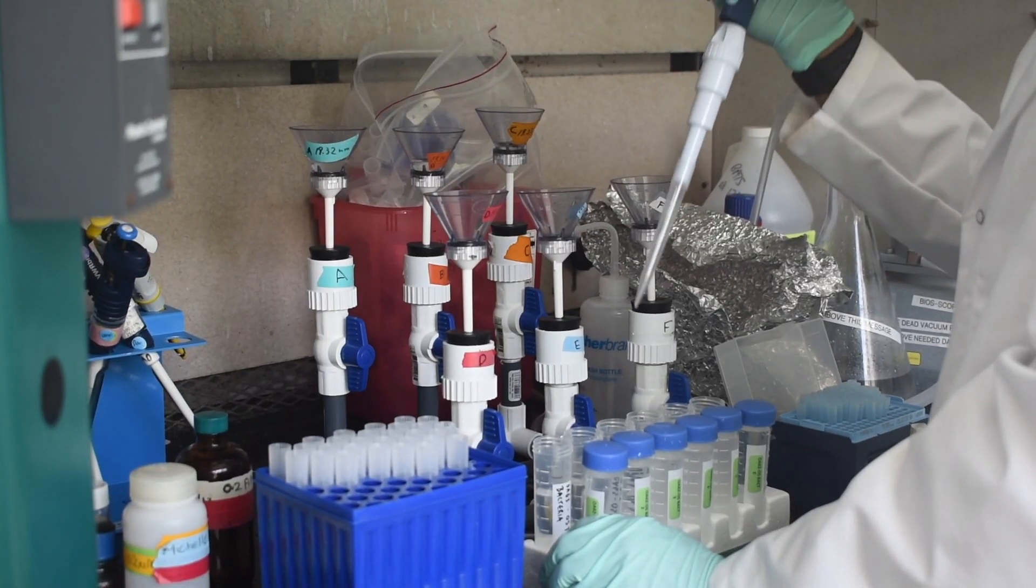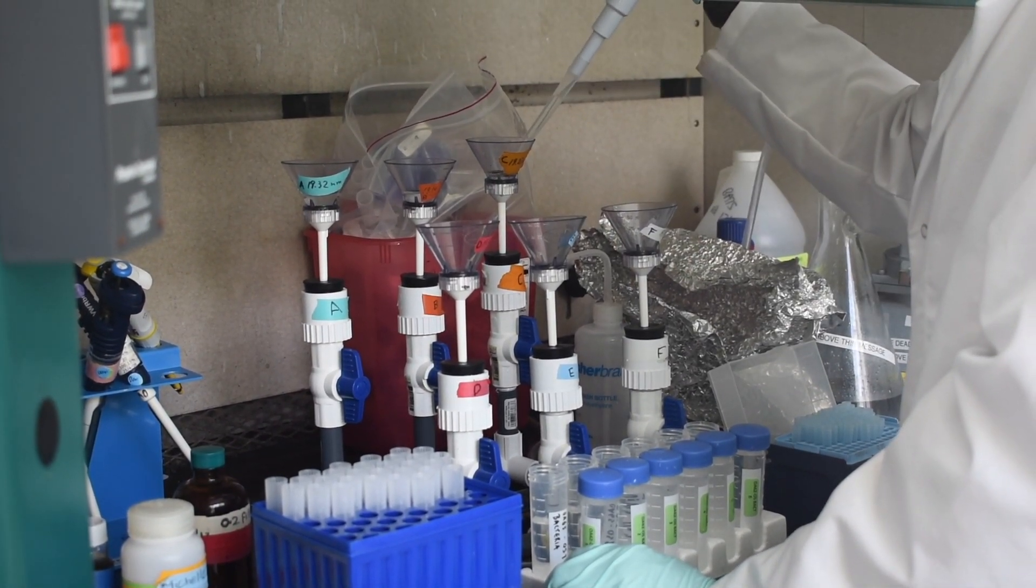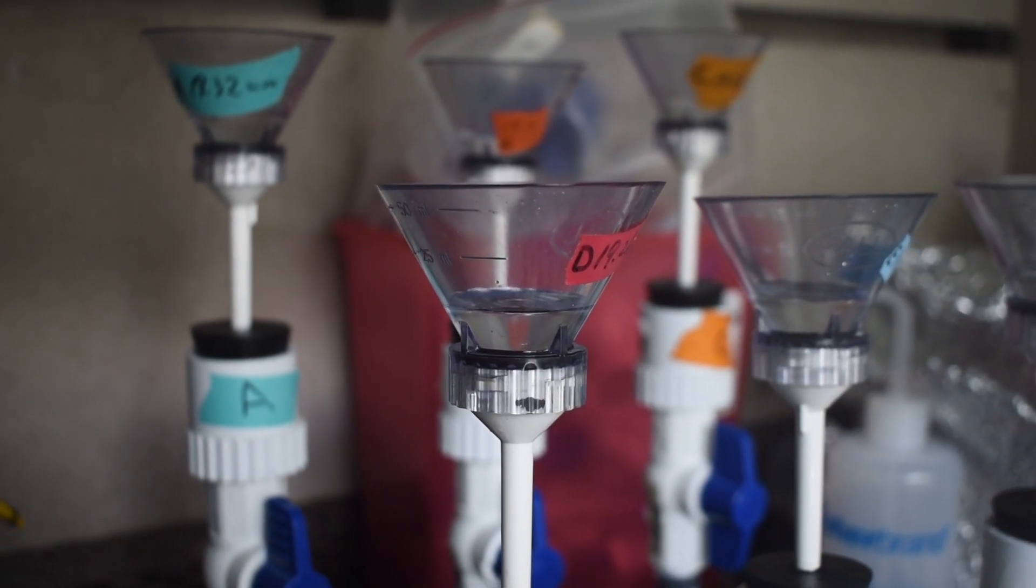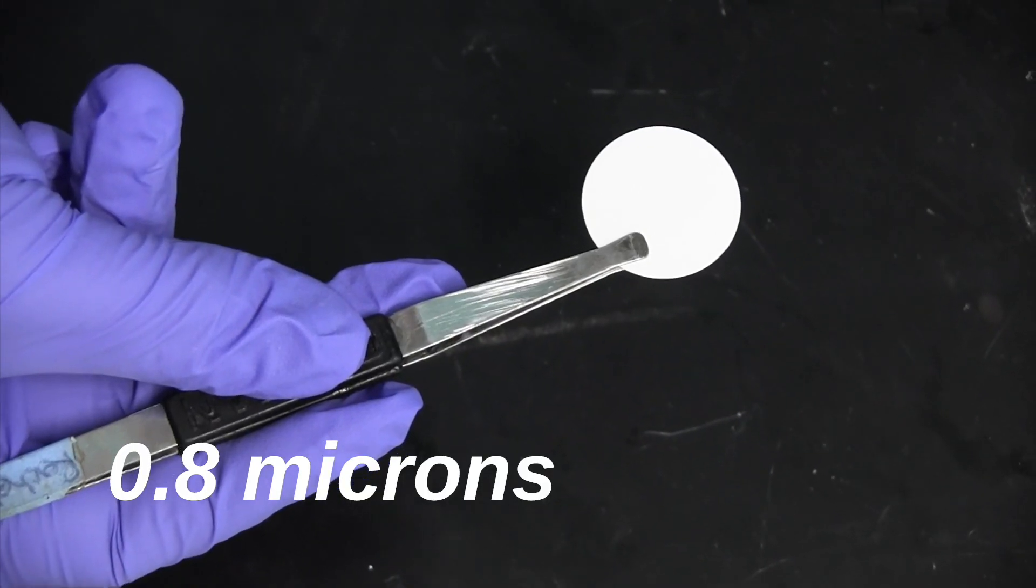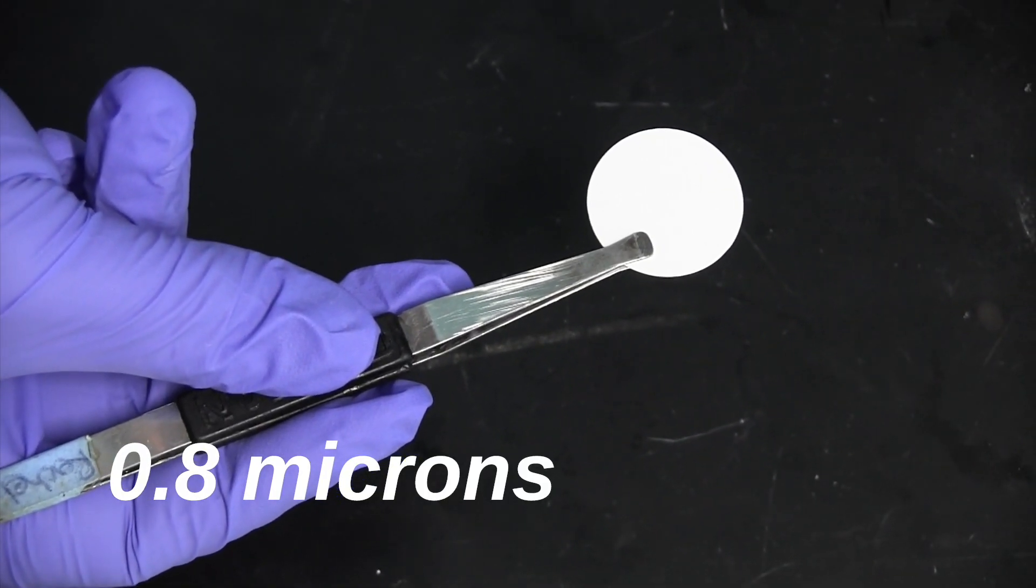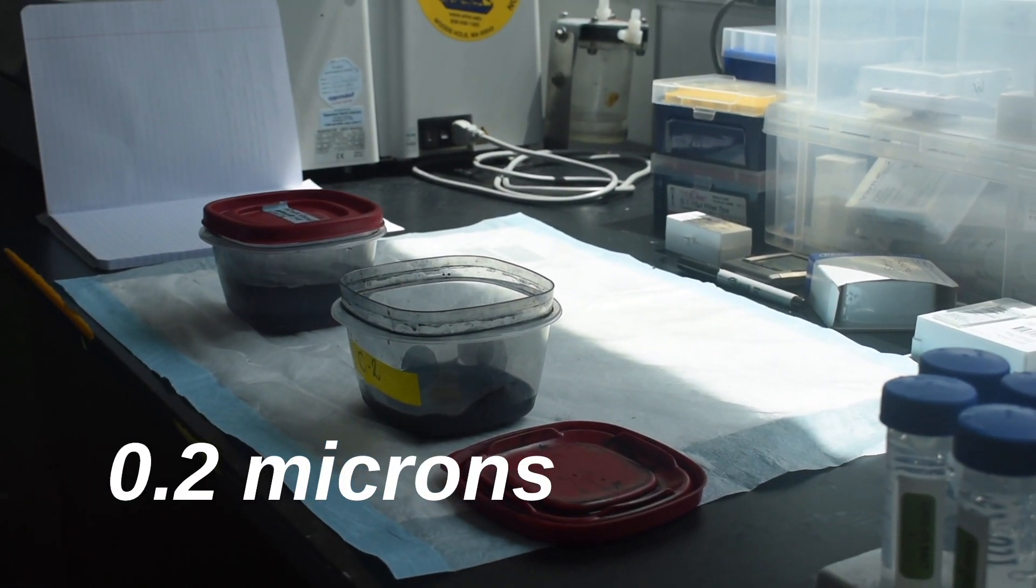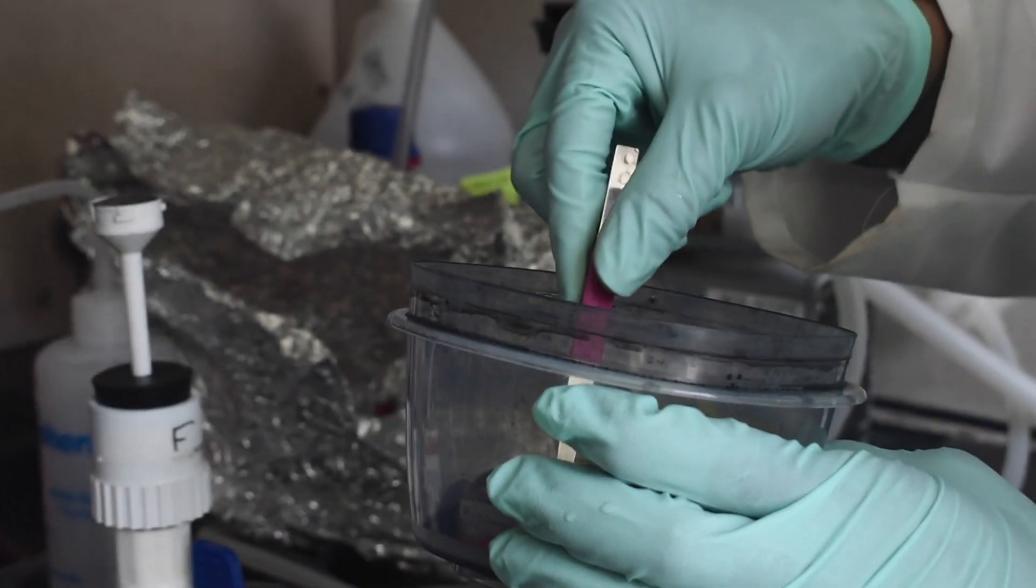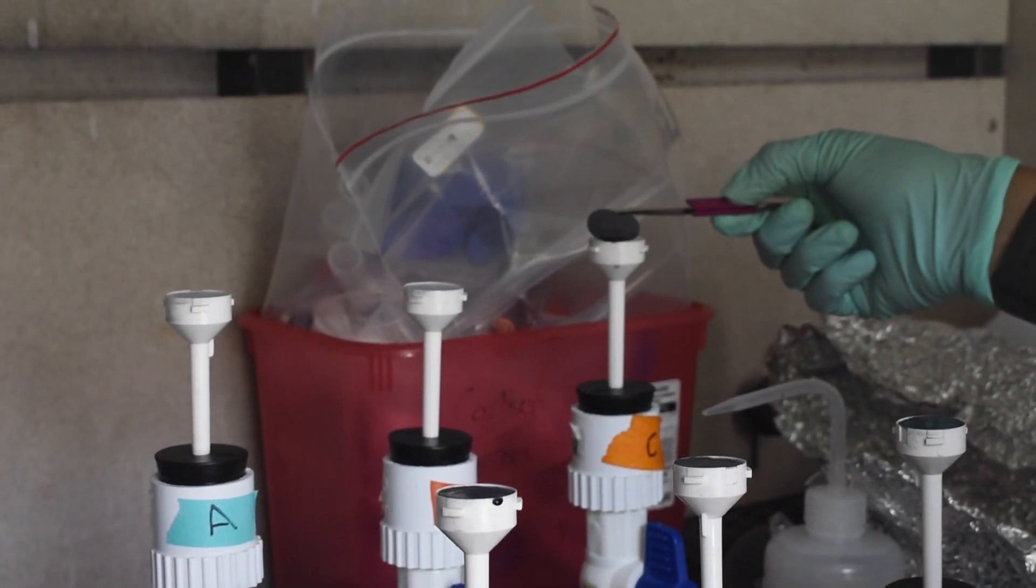Once they're thawed we build the fume hood and we start doing the filtering and so we have the filter rigs and first we need to put on a backing filter which is 0.8 microns and this helps with evenness of distribution of the cells and then we use a 0.2 micron polycarbonate filter for the bacteria and the bacteria stick on top of the polycarbonate filter.